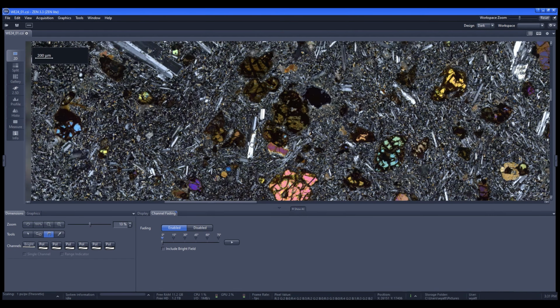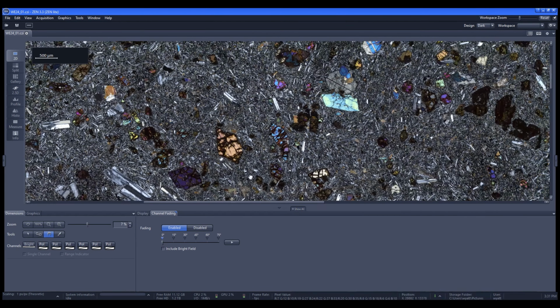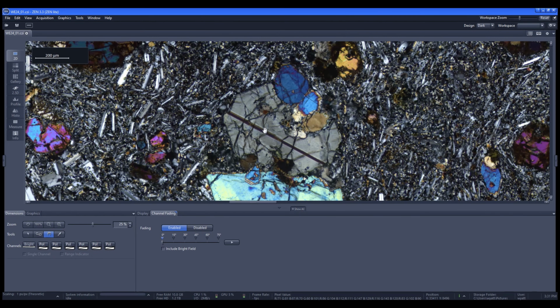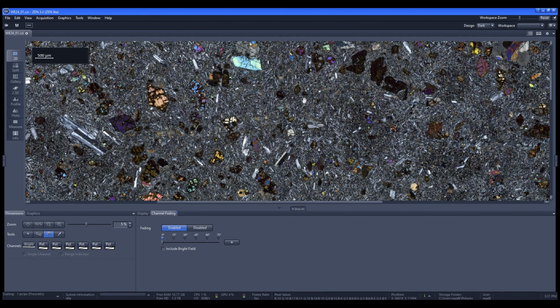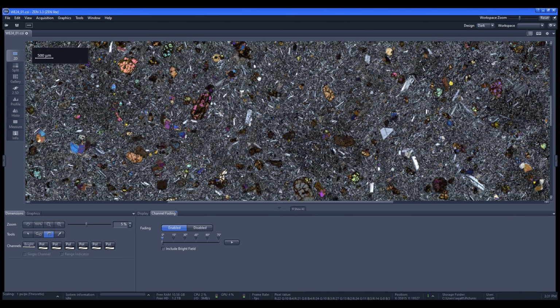You can see there are also phenocrysts of plagioclase, we've got phenocrysts of olivine, and of course phenocrysts of pyroxene. And when we have a bunch of phenocrysts spread out all through the lava like this, we refer to this as a porphyritic texture.